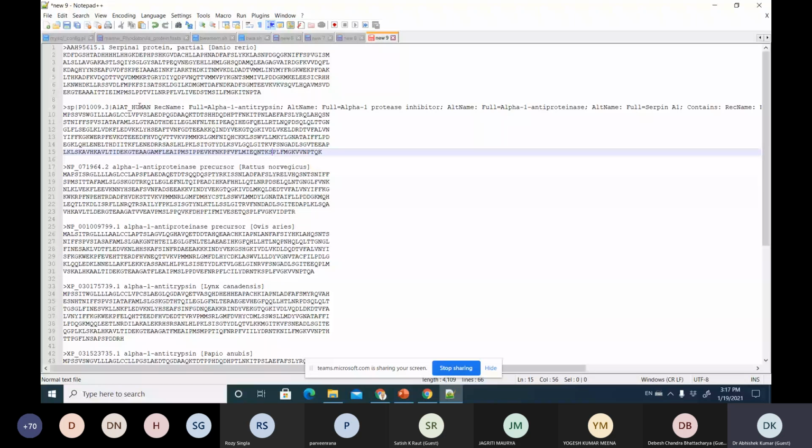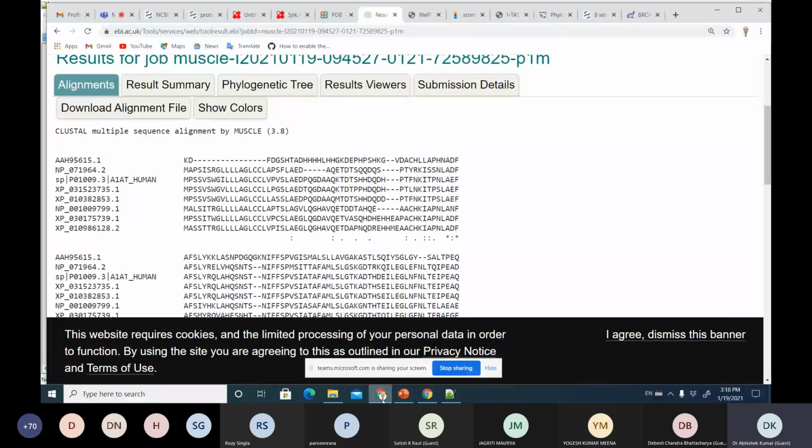If this is a big one, you chunk of this, you need to rename the sequence actually, so that when you are doing the alignment or phylogenetic analysis, you see the meaningful outputs. So here again you have to search because 35, 53, ending with 99, 39, 28, we don't know by name which species which sequence it is.